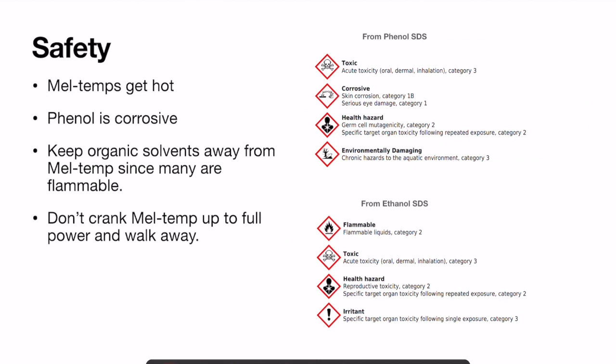Okay, some safety for this experiment. Melt temps get hot, so be careful. Phenol is quite corrosive. If you look at this information from the SDS, safety data sheet, you see it's toxic, corrosive, a health hazard, and environmentally damaging, but the main thing that we want you to be careful of is that it's corrosive. So just handle it in the hood. Make sure you, of course, have gloves on. If you get any on yourself, immediately rinse with water and call your TA.